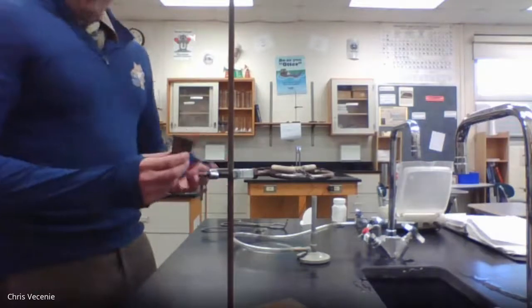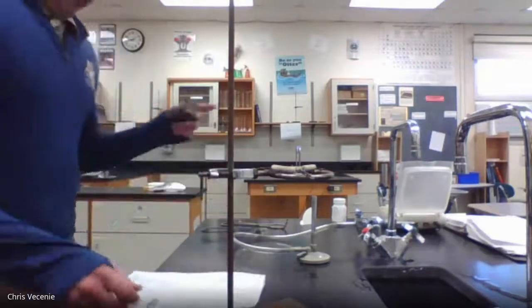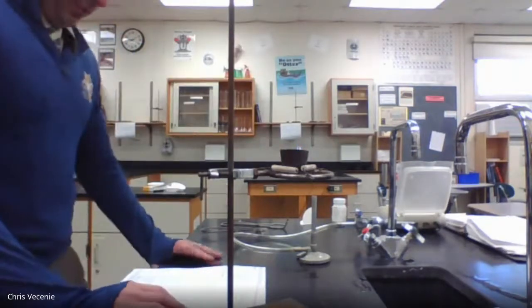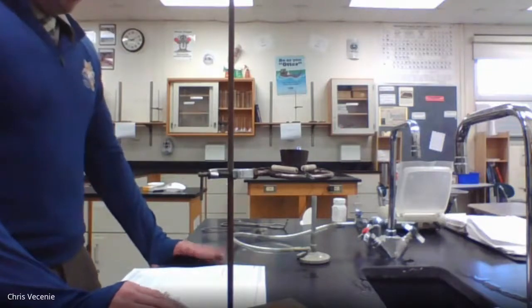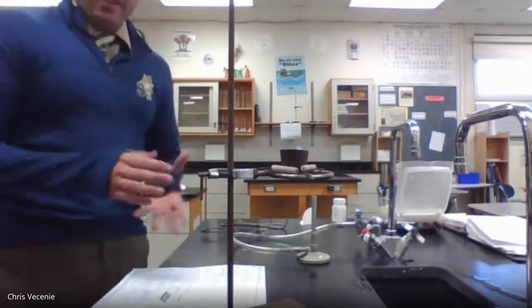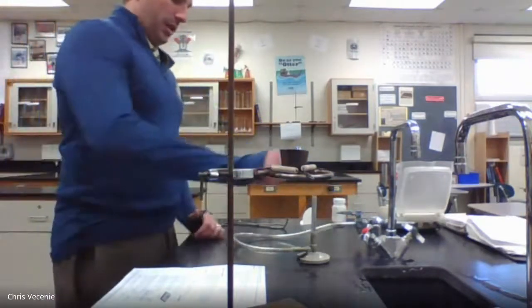All right. If you're following along with the procedure, the first thing it says to do after step 1 is set up a Bunsen burner and a ring stand with it able to hold the crucible, like this. Then it says light the Bunsen burner and brush the bottom of the crucible for about a minute. And the whole point of this is just to burn off anything that might be on our crucible. All right, so I'm going to turn this on. Light my burner.